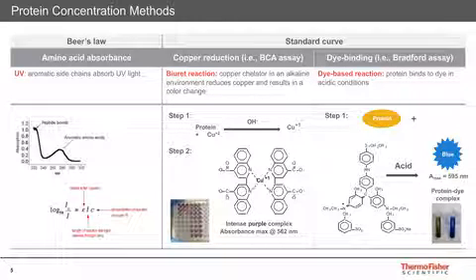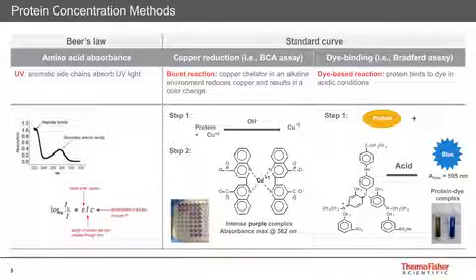Now, for the relative standard curve method, we have a copper-based method and dye binding method. I will get into more details of these methods in the following slides.